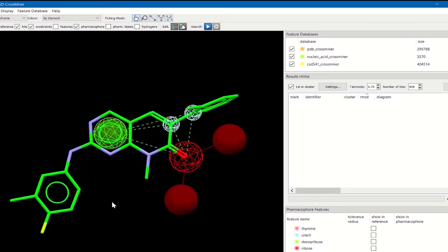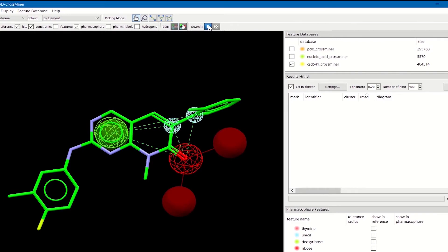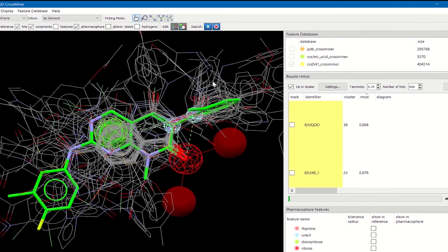In this example we are going to look for new chemistry to replace the central ring, so we can disable the PDB and the nucleic acid database and only mine in the CSD. If we are happy with our query, we can then click on the play button and start the search.